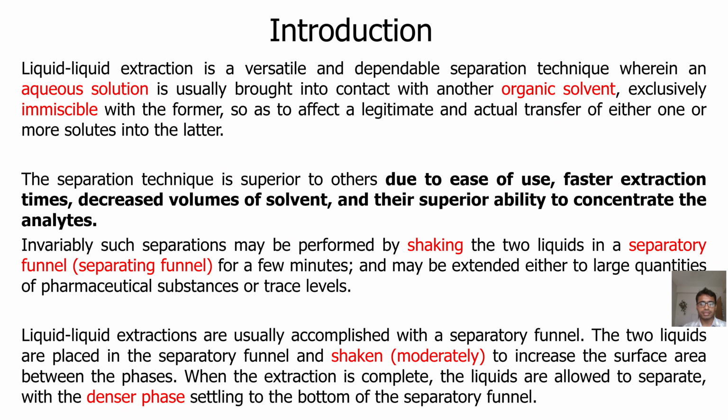Liquid-liquid extraction is a versatile and dependable separation technique wherein an aqueous solution is brought into contact with another organic solvent exclusively immiscible with the former, so as to effect a legitimate and actual transfer of one or more solutes into the latter. The separation technique is superior to others due to ease of use, faster extraction time, decreased volume of solvent, and superior ability to concentrate the analytes.